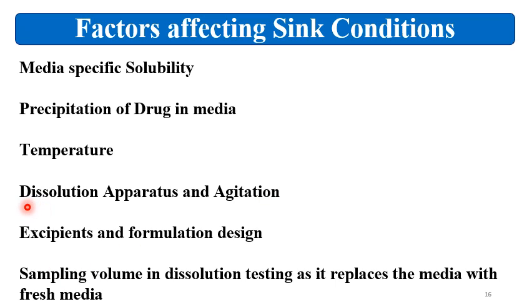See, if you have the volume greater than the saturation volume, still it is not a guarantee that you will get a complete drug release, because sink condition alone cannot guarantee the complete release. It has the effect of dissolution apparatus and the agitation. Agitation means the RPM of the paddle apparatus or basket apparatus, or dips per minute for the USP3 apparatus, or flow rate for the USP4 apparatus.